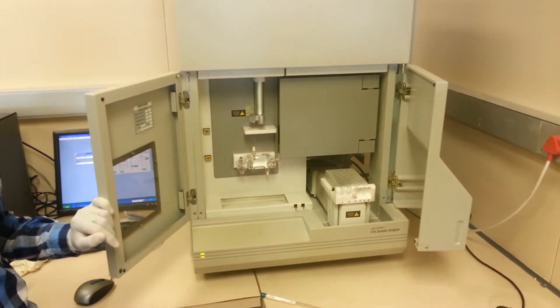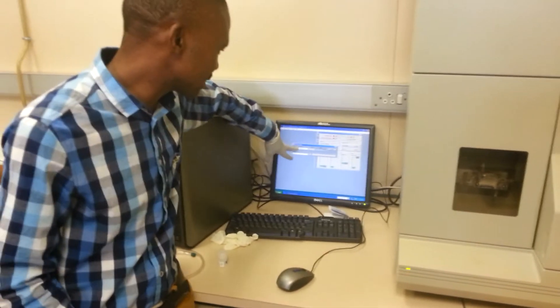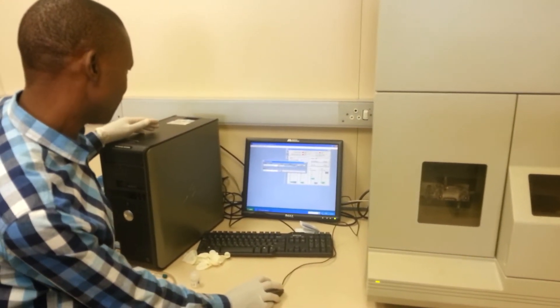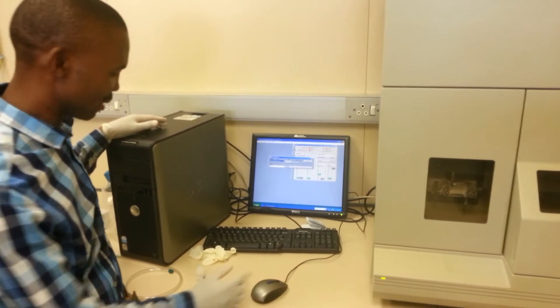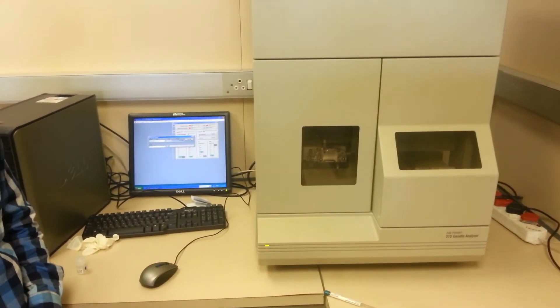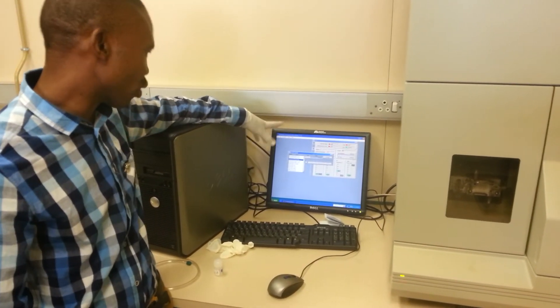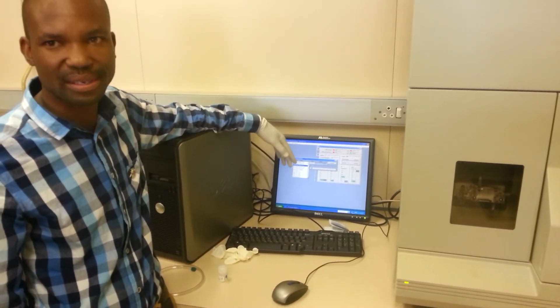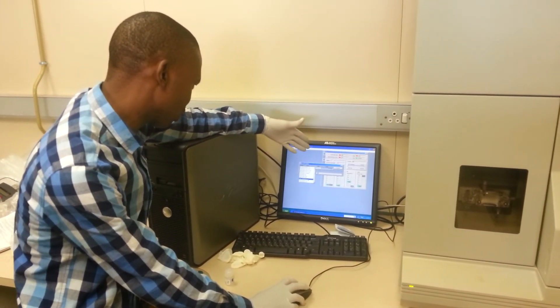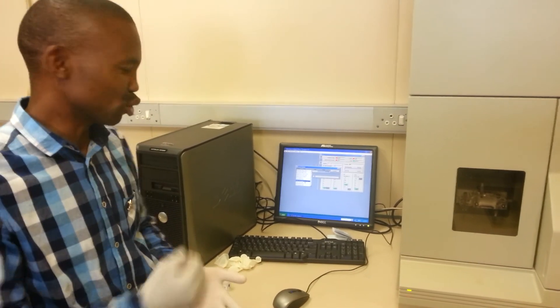You can see now it's forward. There are actually quite a lot of instructions here that you can do manually to control the instrument. If you want to return the tray, you can go to auto-sampler return tray and hit execute — it will retract the tray. There are many commands available: auto-sampler out, auto-sampler down. Some of them are not really necessary; it's just if you want to do something manual. Also buffer valve open, buffer valve close. I will show you now when I'll be doing the washing of the capillary array, and also the priming of the array.